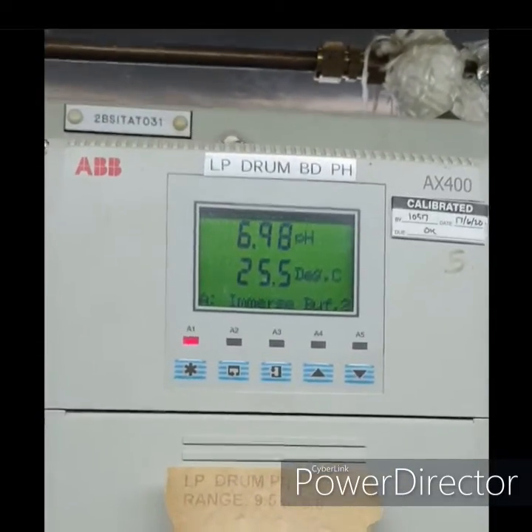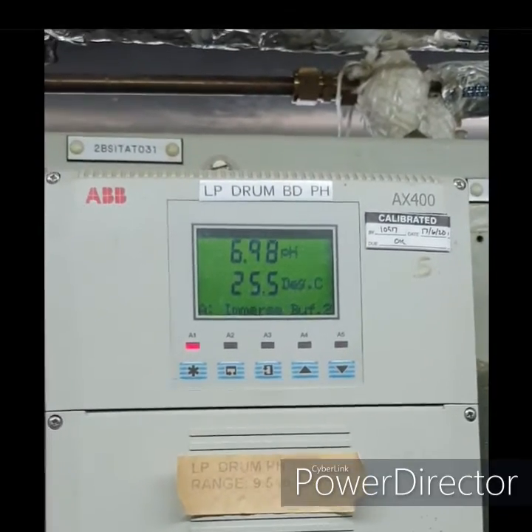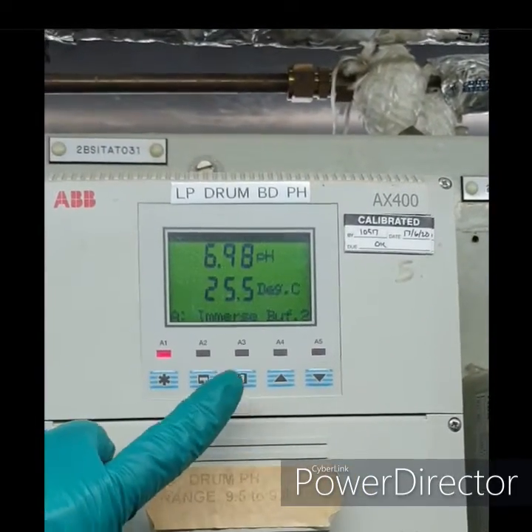The reading now is 6.98. It is stable. We can proceed now for the buffer process.